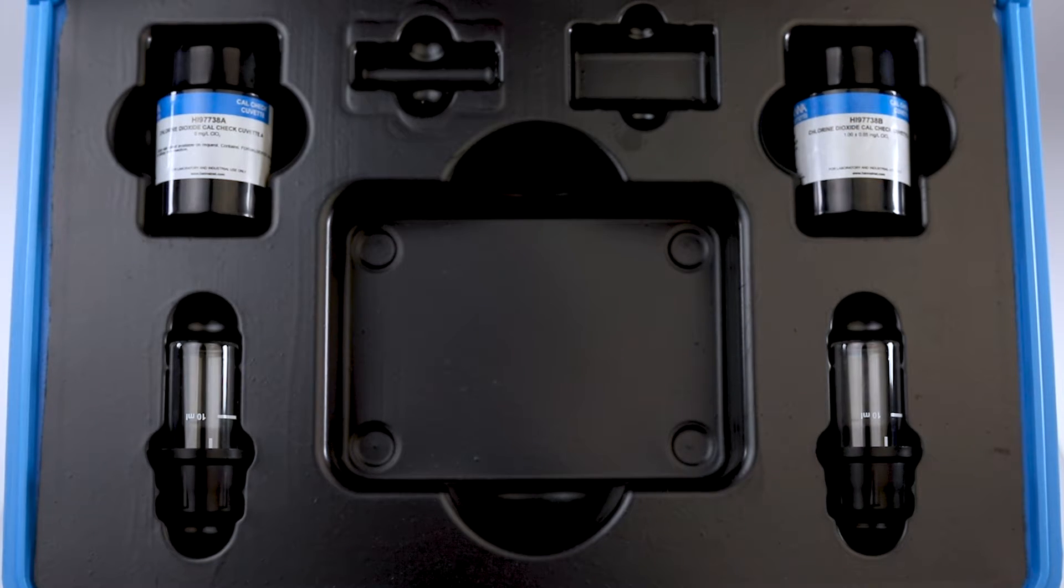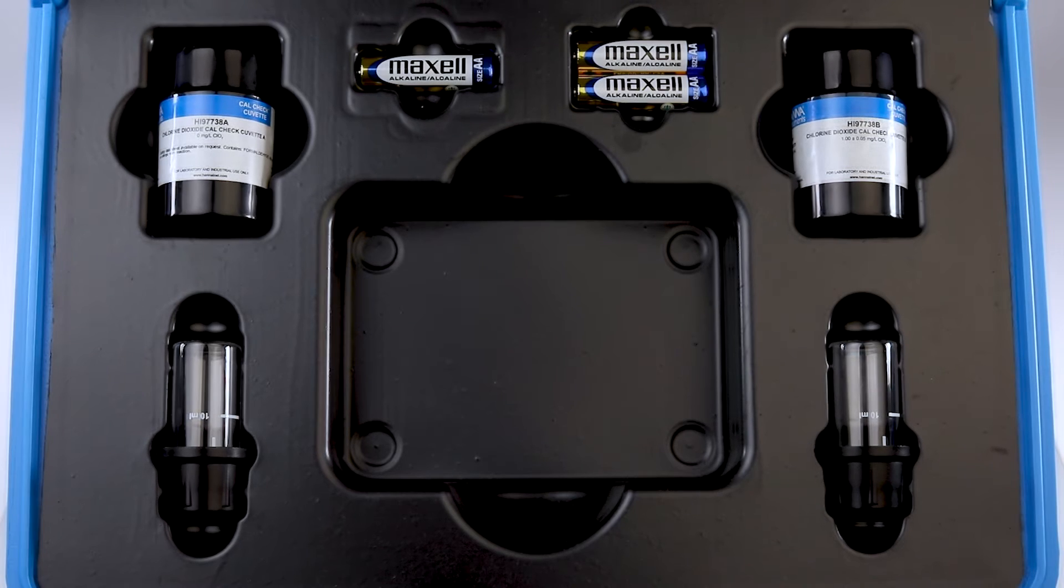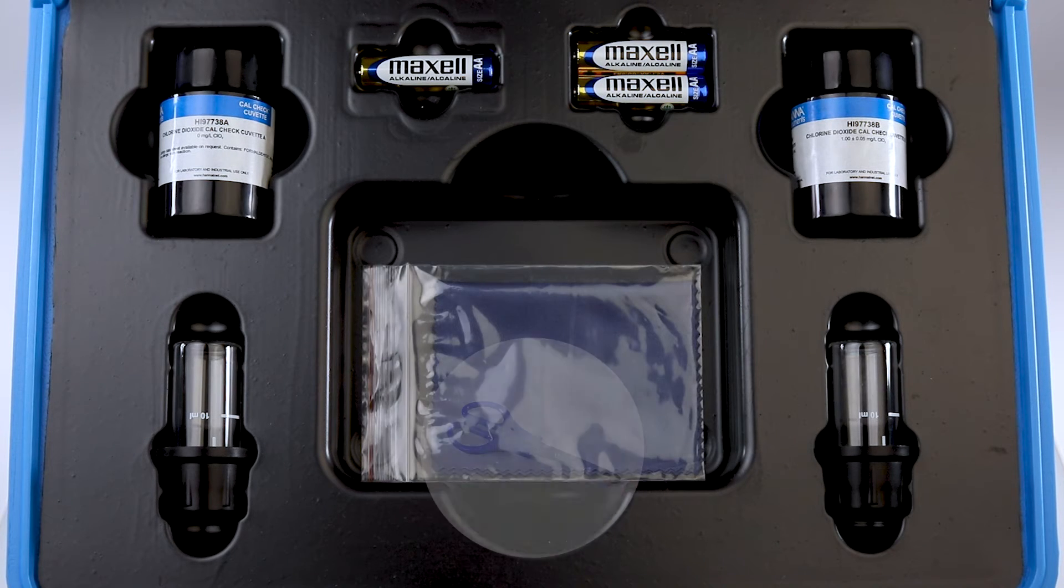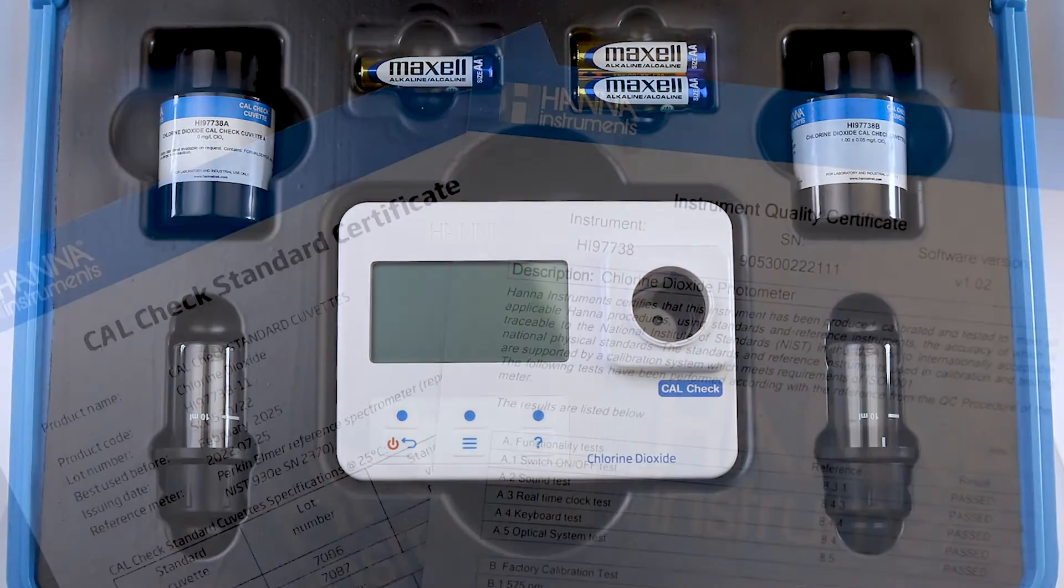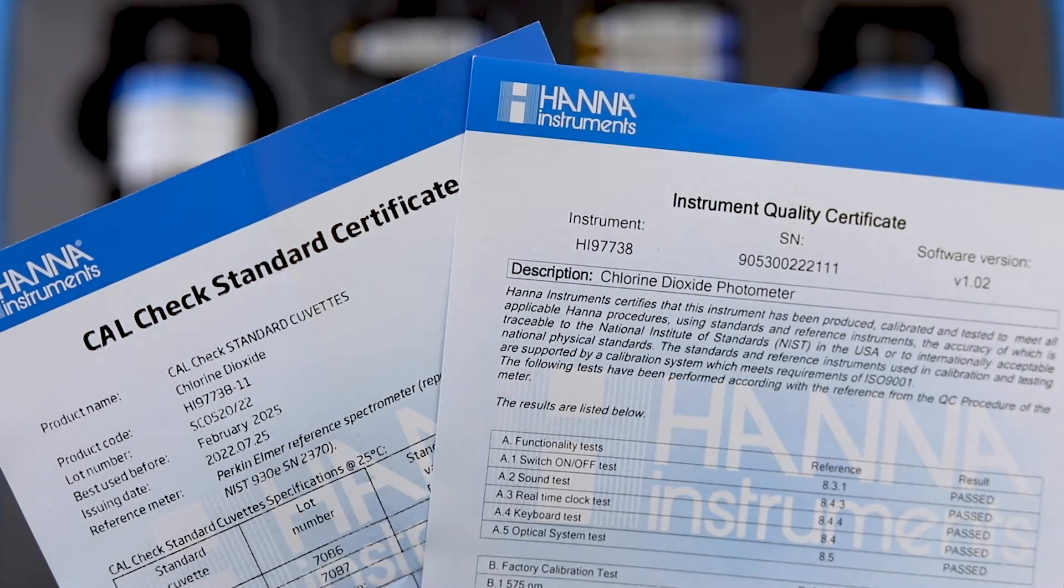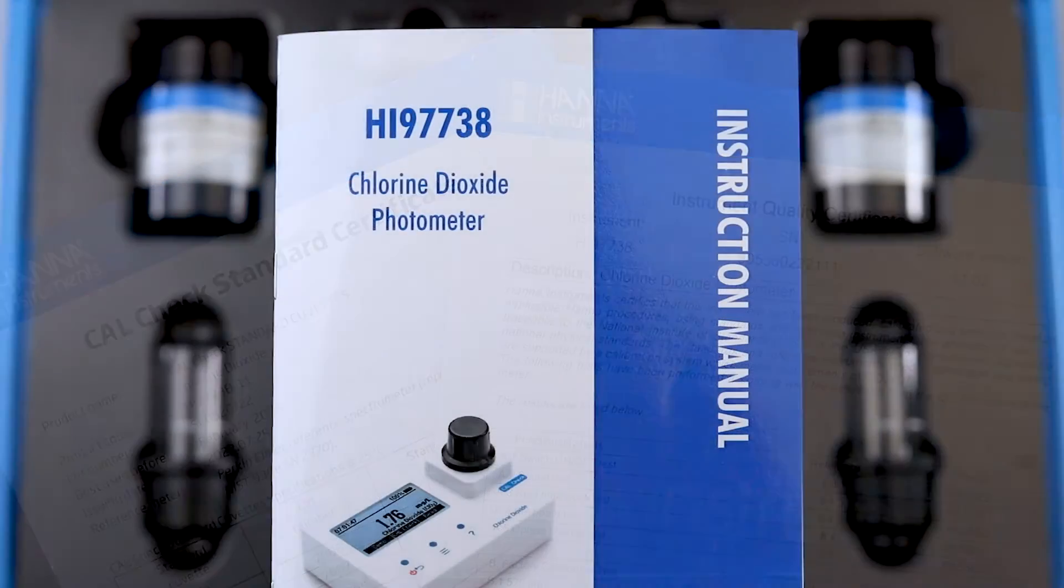The kit includes 2 sample cuvettes with caps, 3 1.5 volt AA batteries, a microfiber cloth, scissors, your HI-97738C photometer, CalCheck and instrument quality certificates, and your instruction manual.